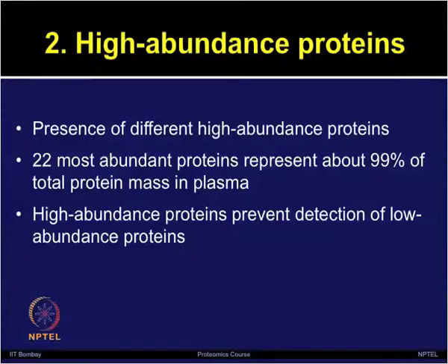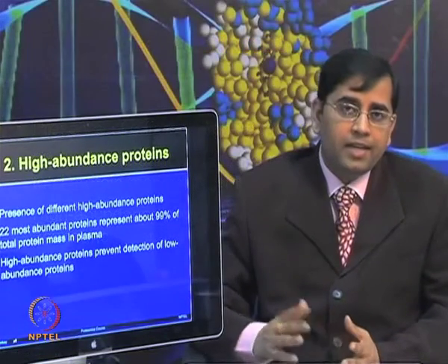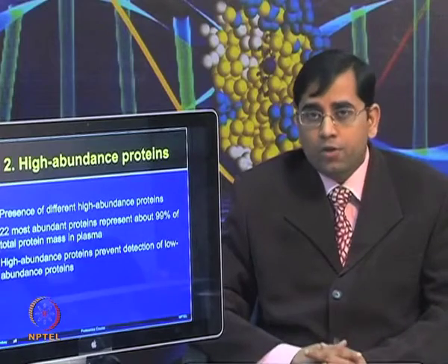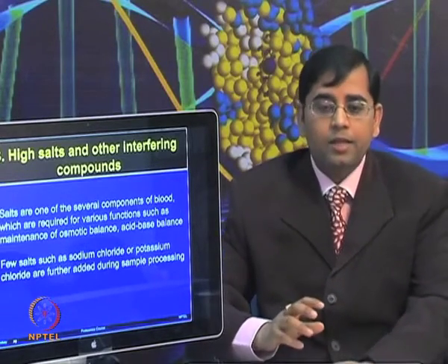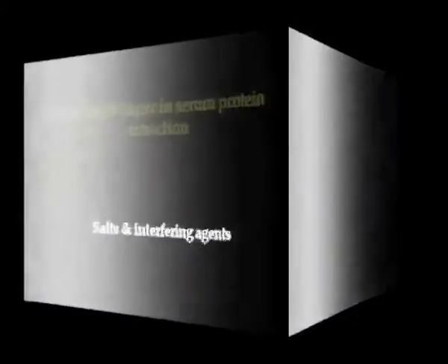So, how to get rid of the high abundant proteins? I will describe some of the strategies which can be used to remove high abundant proteins in the next couple of slides, but first let us talk about the other challenging factors for serum or plasma analysis.